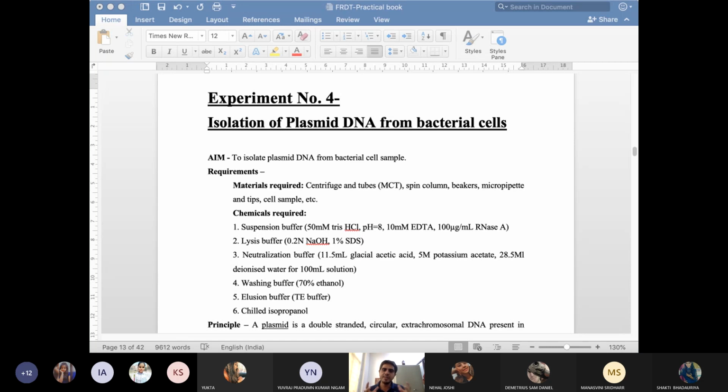Okay, so now what is the game in between these two? The game is that your plasmid DNA, very small and being supercoiled, will form the double-stranded bond. Now the chromosomal DNA, which was very large in size, when you neutralize it, will also start forming that double-stranded structure. But being larger in size, and also one more thing is there in your chromosome. When you define your chromosome, you mentioned that chromosome is a nucleoprotein complex.